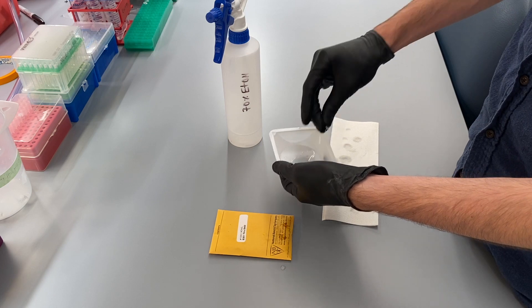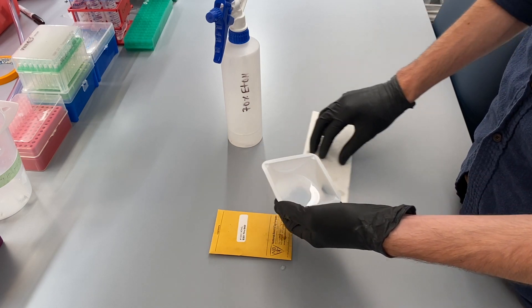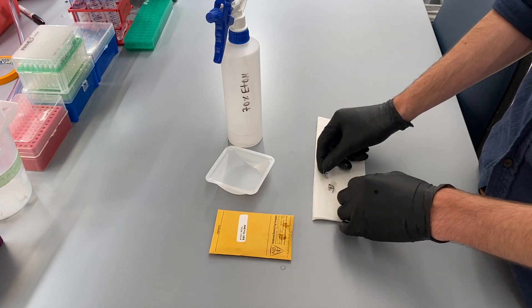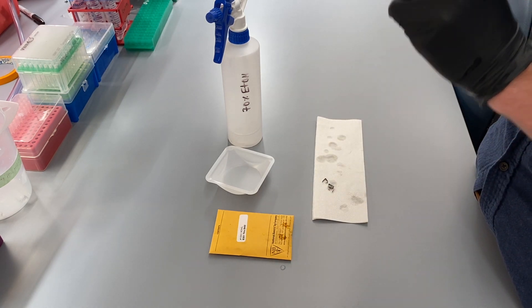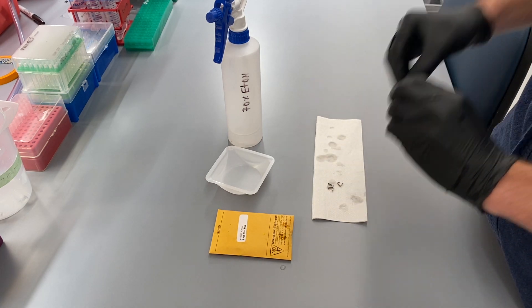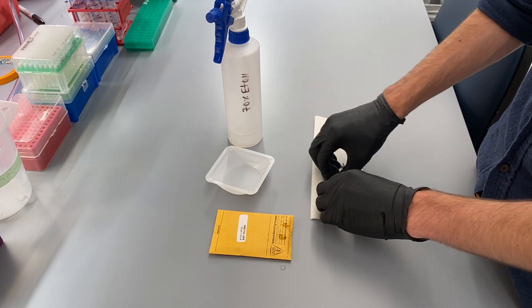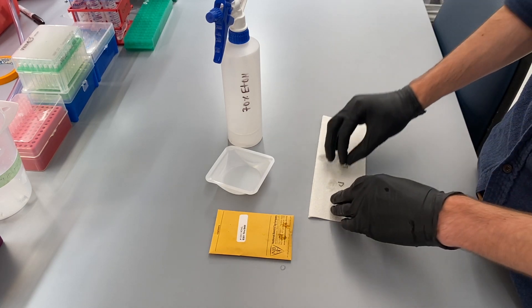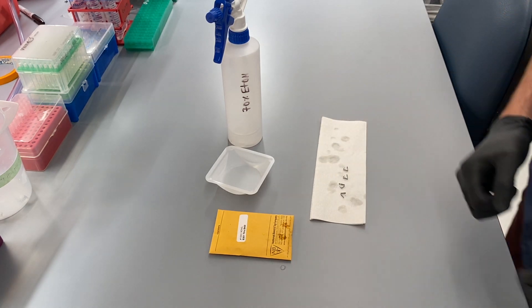After the tags have been rinsed, I once again place them on a paper towel to dry prior to organizing them in order to make the whole ear tagging process more efficient. I order them by tag number, and you'll see in a moment how I prepare the tubes and the organization sheet in order to simplify the entire process.